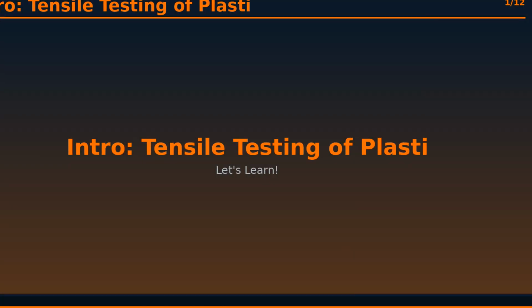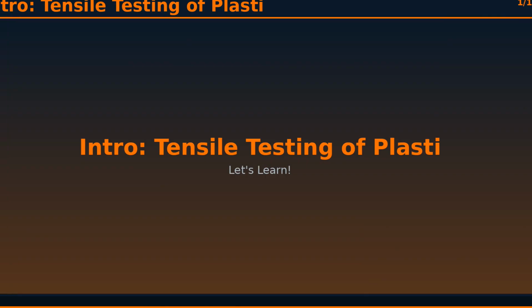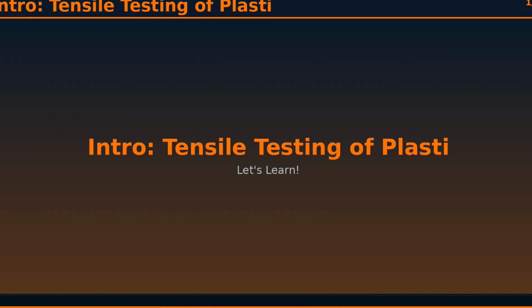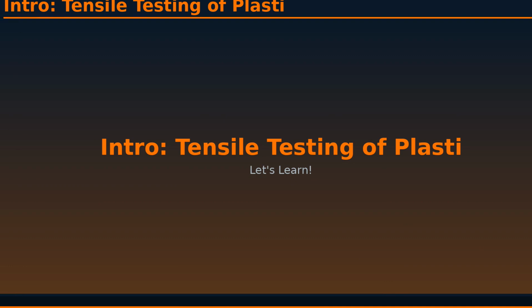Today we learn about tensile testing of plastics on UTM Machine. This is a fundamental concept in plastics engineering with wide industrial applications. We will cover principles, processes, and real-world examples in this lecture.